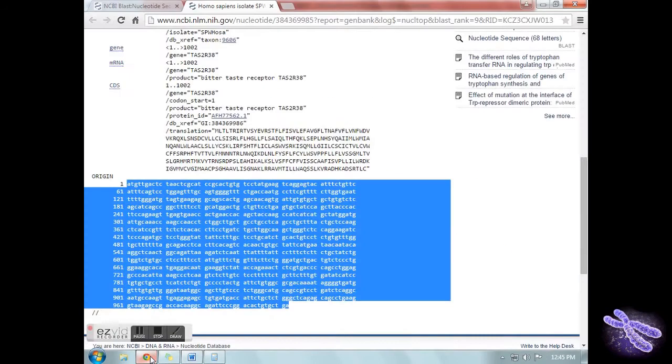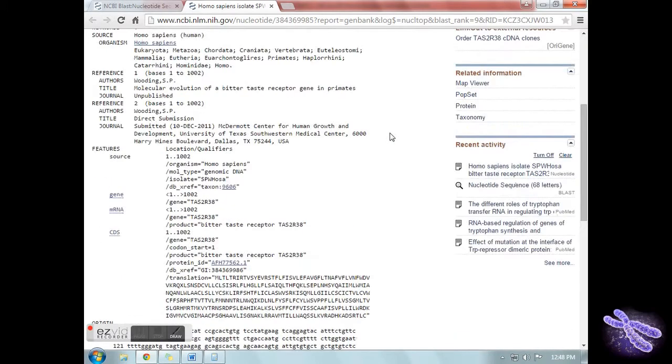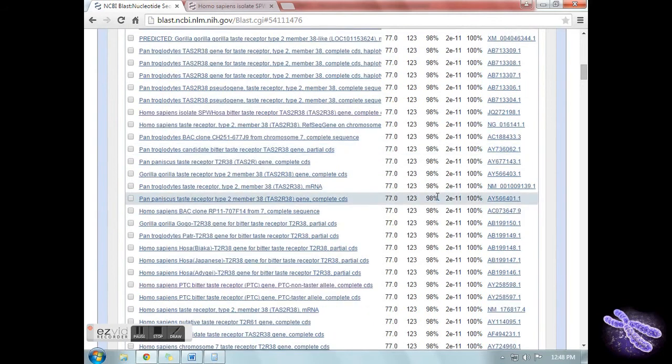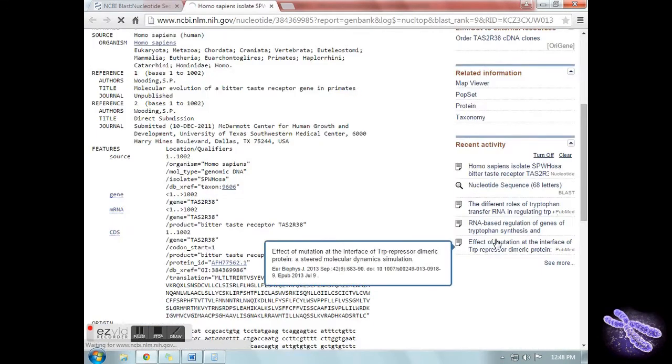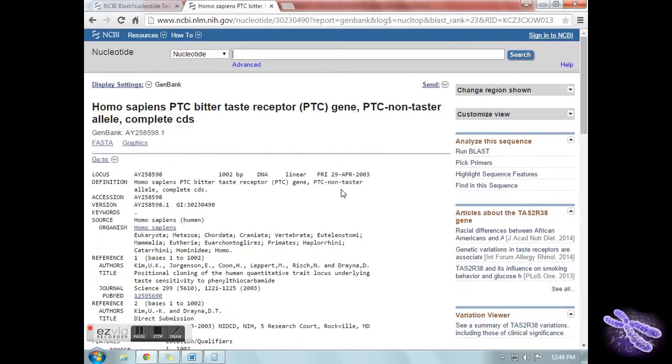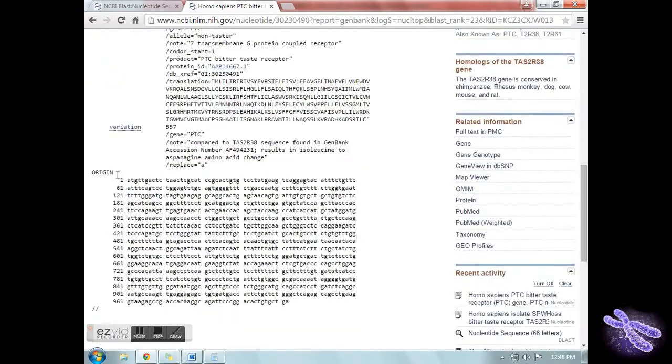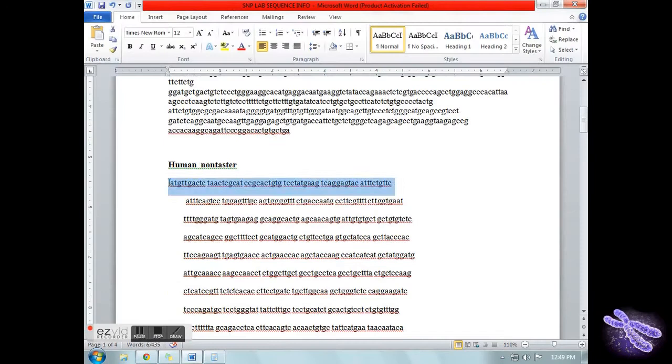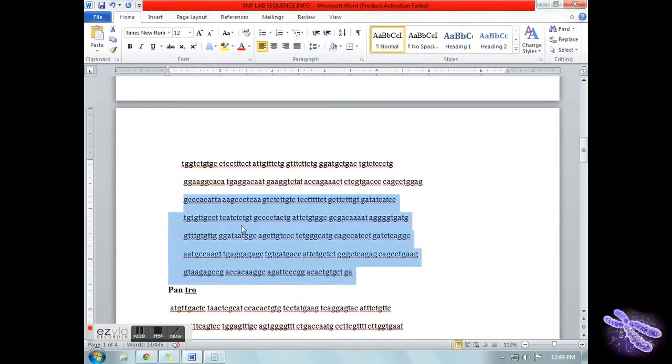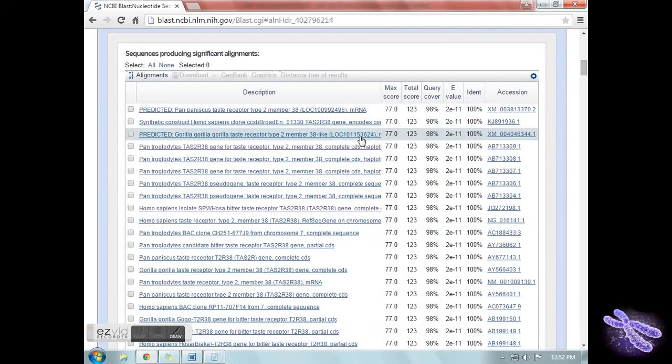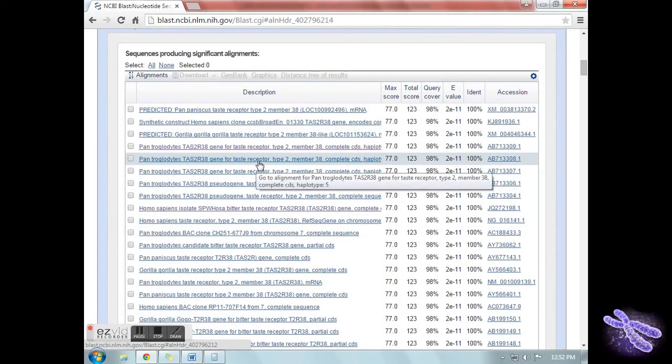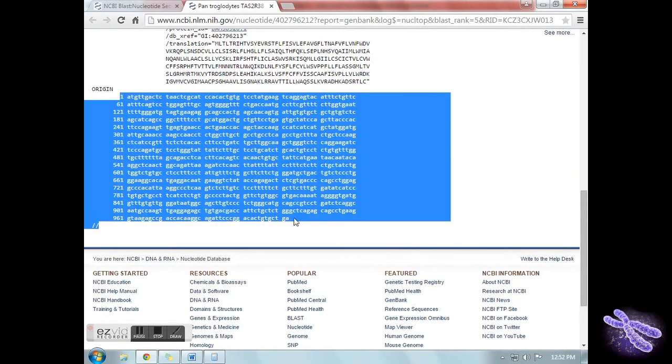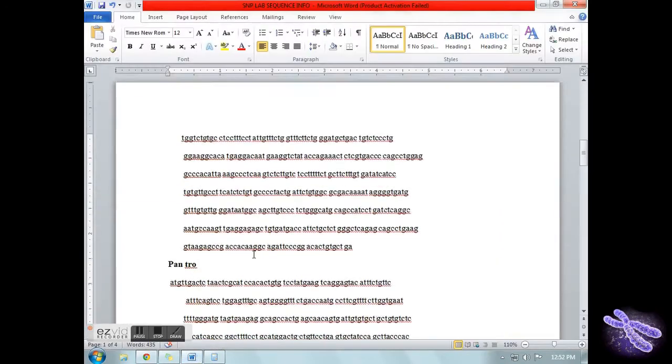Go back to the page and select the accession link for the human non-taster allele. Make sure to copy and paste the base pairs only. For your purpose, make sure to put in whatever species you need to define. For example, Pan troglodytes, Pan paniscus, and Gorilla. Make sure to only use the complete coding sequence.